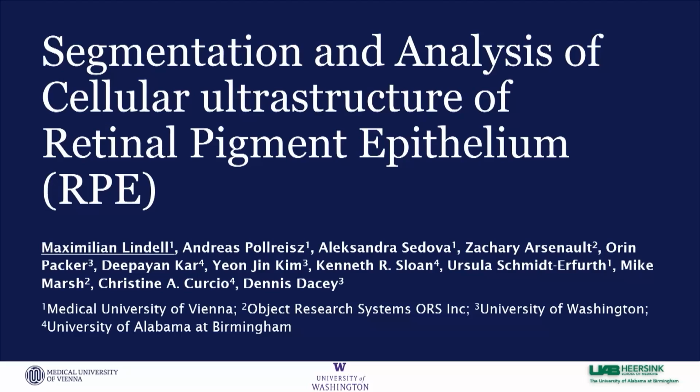So let's look at these cells on the back of your retina. Okay, hi everyone, I'm Max, and I do come from Austria. I'm an American though, so that's why I don't have an accent. And I'll be telling you about our work reconstructing an individual cell from the retina.